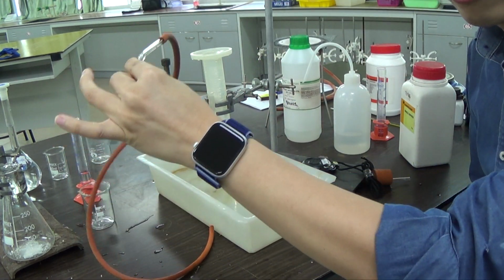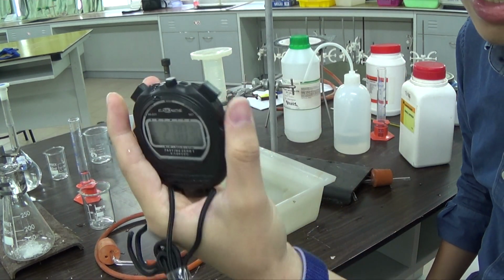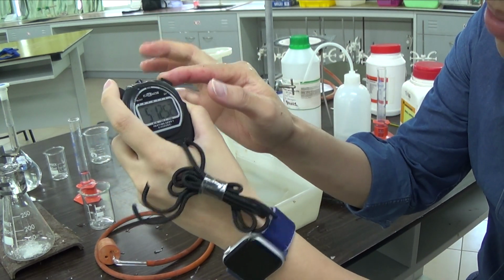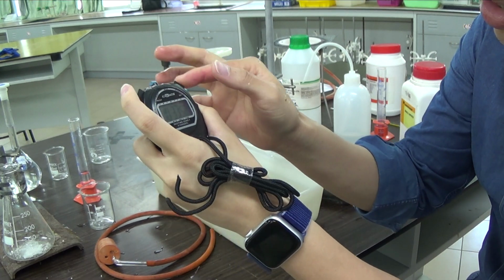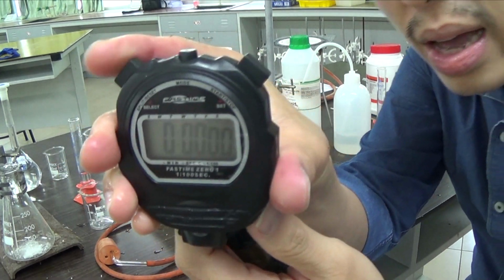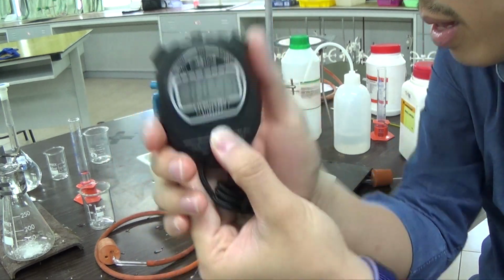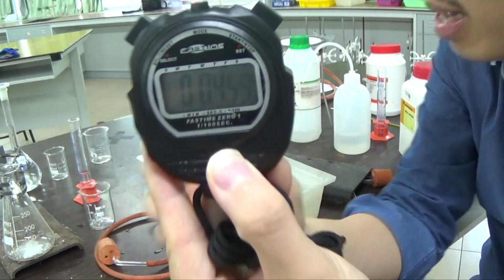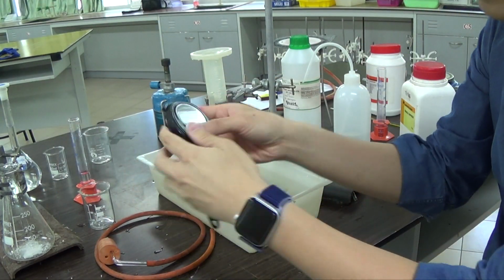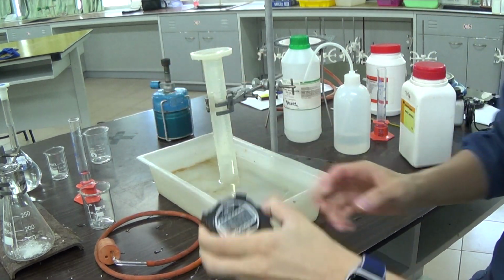because you want to have the inlet at the bottom for you to put the delivery tube. So remember that we could potentially start timing, and if I start timing and leave this on the bench, when it reaches 10 seconds, I will pour in the acid and close it, and then there will be a more accurate result actually. So perhaps that is what I should do here, okay?